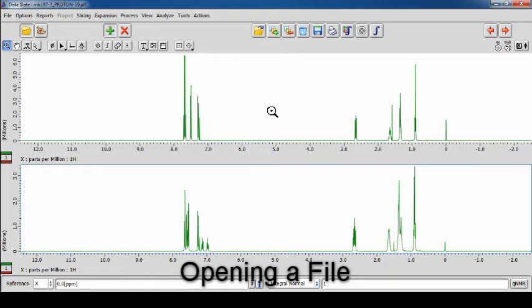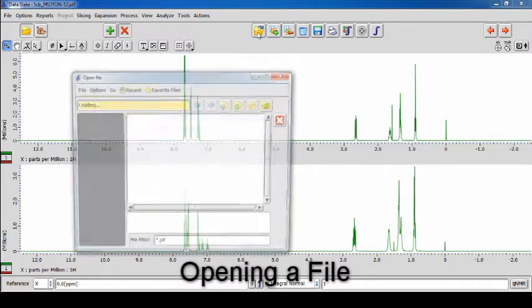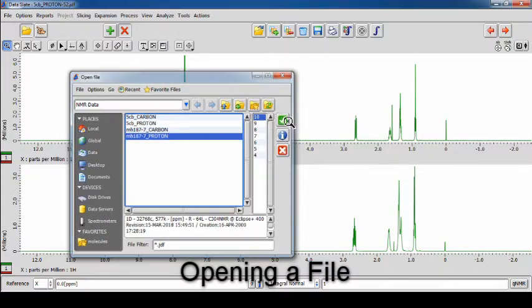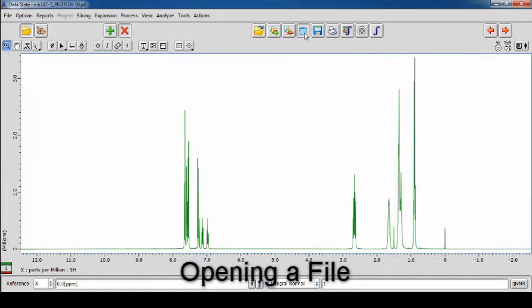Having the red cross toggled will cause any file opened to overwrite the selected geometry with the file you just opened. It will also prevent the opening of any new data files from the File Explorer if no geometries are present on the dataslate.